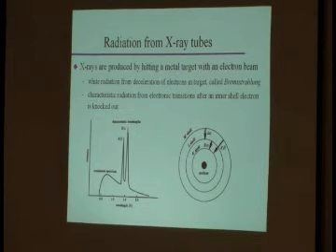What we work with is, in many cases, the electron that hits the target will eject a core electron. Of course, atoms aren't really happy when they have a hole in their core electron shell, right? So one of the outer electrons will fall down. We all know that the different electronic shells have different energy, which means the energy difference is emitted. Guess what the energy difference is like? It's right in the X-ray region. That is why we get emission of X-rays.